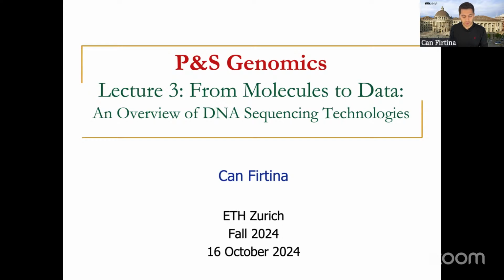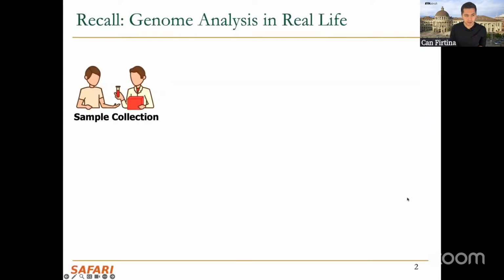Welcome everyone. Today we will cover basically the ways that we convert the biological molecule, DNA or RNA, to digital data so that we can analyze it. With that, I'll start with some reminder slides from the previous week. We covered some of these.